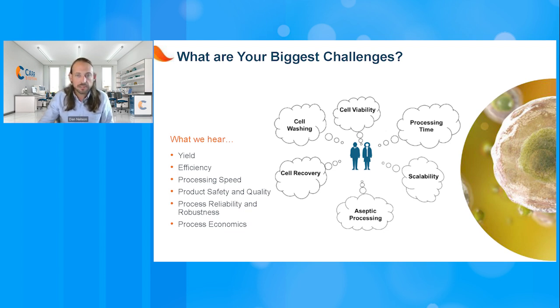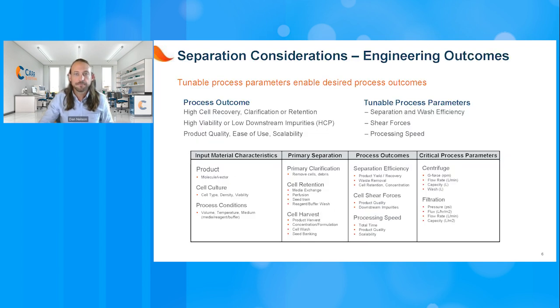So let's take a look at the live results. Miles, there we go. Thank you. All right, so we've got a lot of depth filtration, some centrifugation, disc stack and tubular bowl, a lot of TFF and ATF. So a good mixture here. And this is something that we would expect, because each one of these separation applications has different needs.